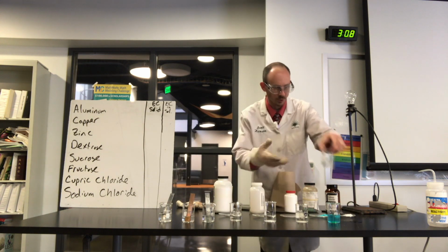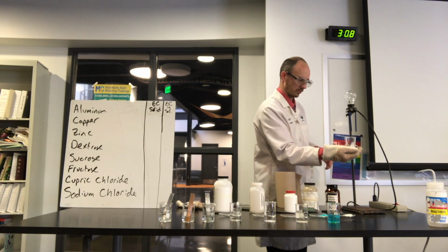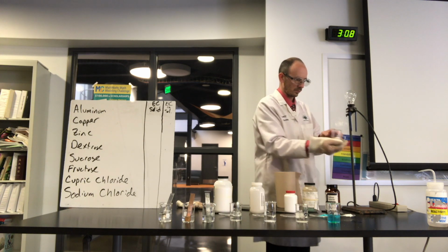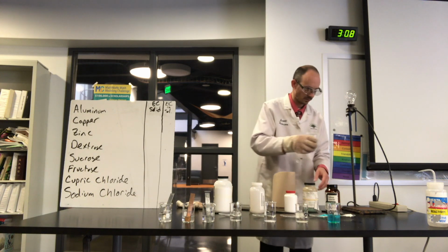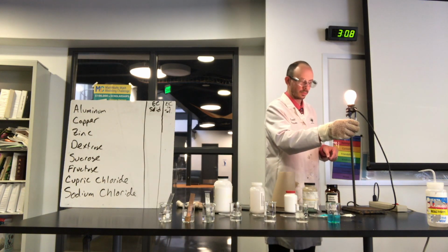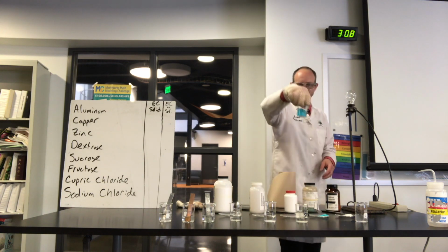Okay, so here's the first one. This is sodium chloride. Okay, haha, light. All right, here's the next one, copper chloride.